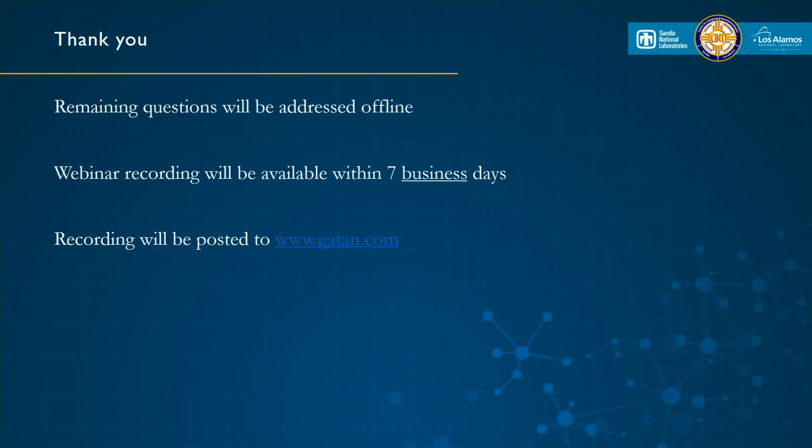Another question that just came in: what is the standard way to measure the electron dose? How do you measure the electron dose?